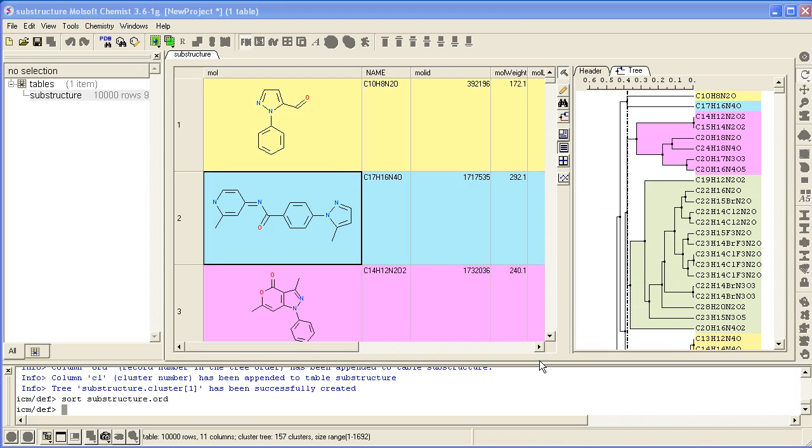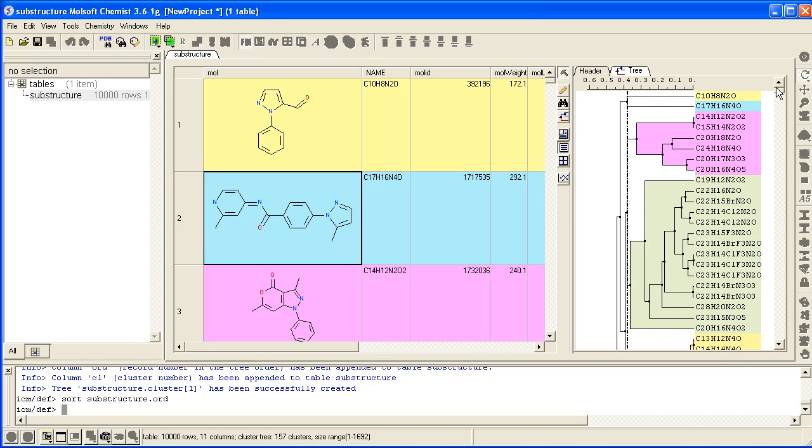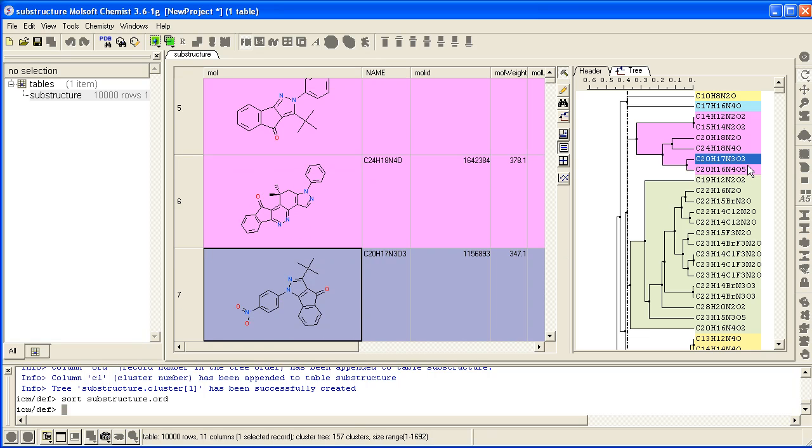Once the clustering is finished, your tree will be displayed on the right hand side, and the tree is directly linked to the chemical table by color. And also if you click on one, you jump directly to that point.